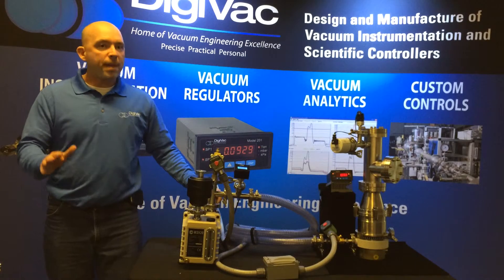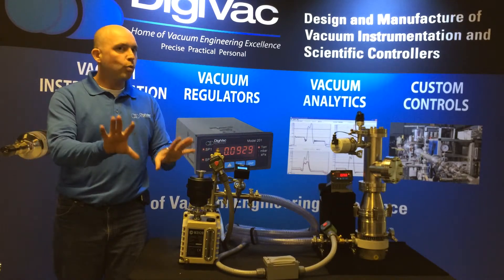Okay, 99 millitorr. Oh! Power outage! What do we do? We're good — we've got the interlock solution.